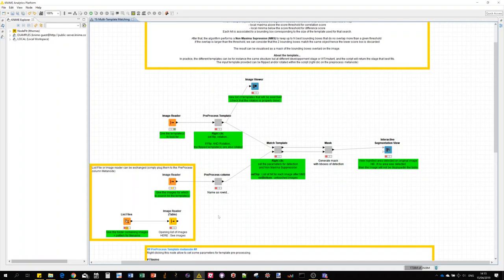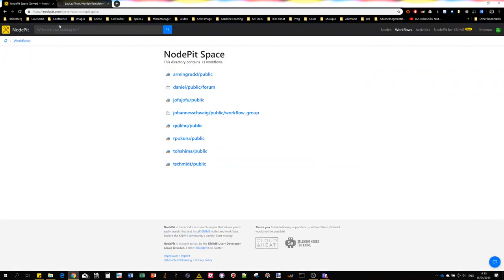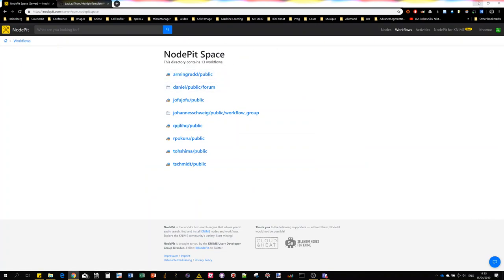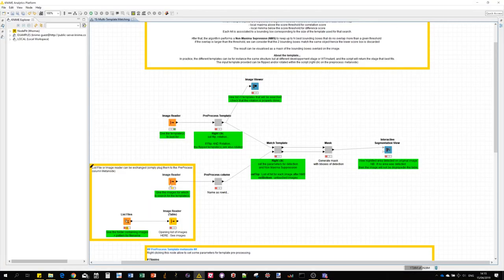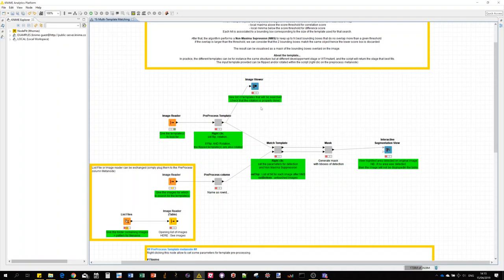Once you have downloaded also the workflow file, which by the way will also be on node speed space, then you can just open it here in the KNIME analytics platform and you should see something like this. The way to understand it is from left to right. Basically on the left we have the inputs, in the middle we are processing, and on the right side we have the result and visualization.